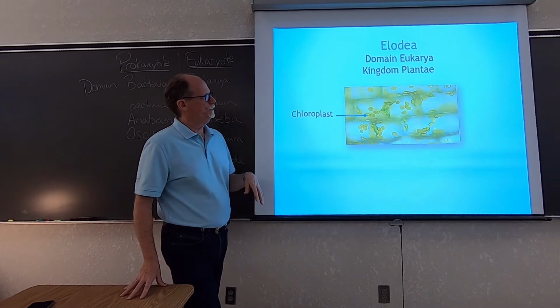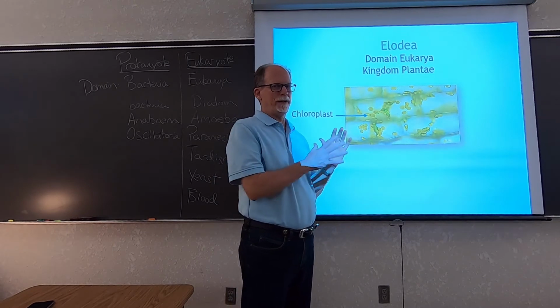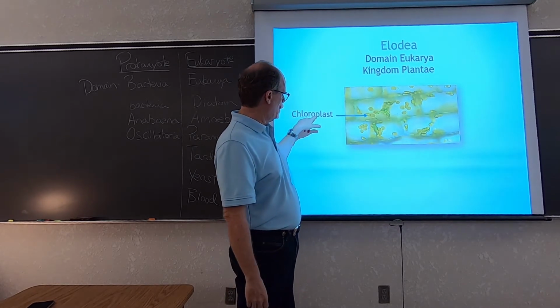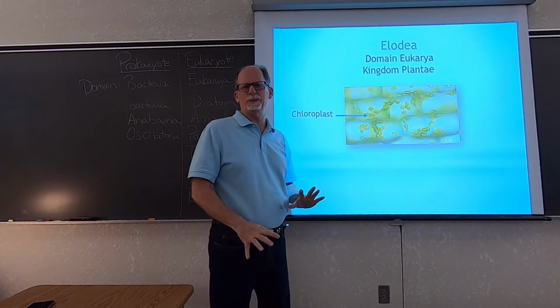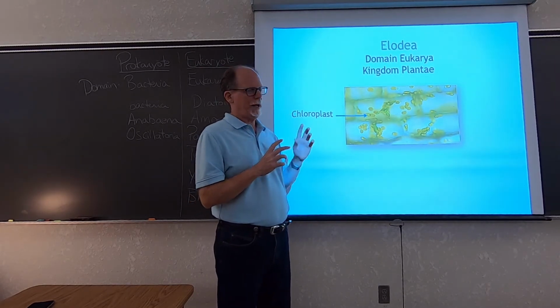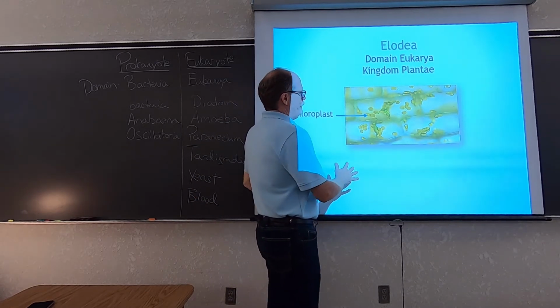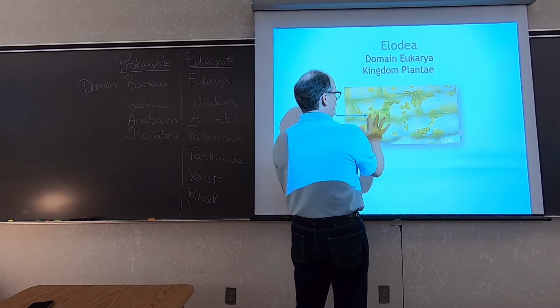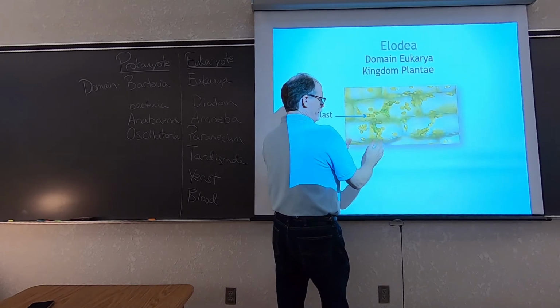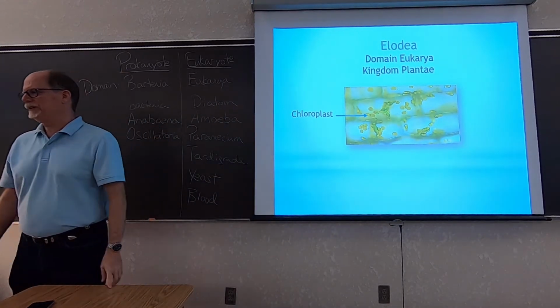Now, this is a plant cell. So normally we differentiate animal cell versus plant cell, right? And plant cells tend to have chloroplasts and appear green in color. Not always, but most of the time. The green is from the chlorophyll in the chloroplast. The chloroplast is the site of photosynthesis, and they're basically little discs. And because there are cells on top of cells, depending on where you are focused, these chloroplasts might not be in this cell; they might be in the cell on top.